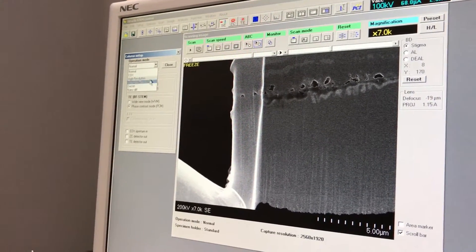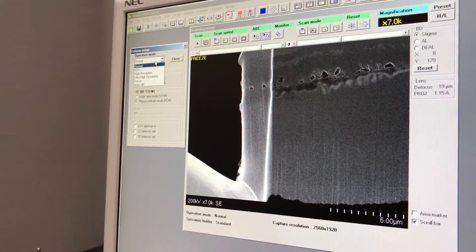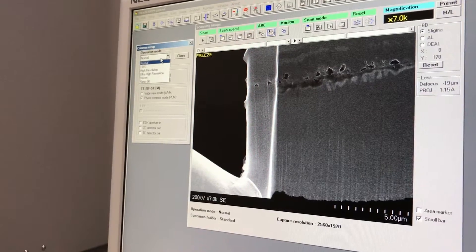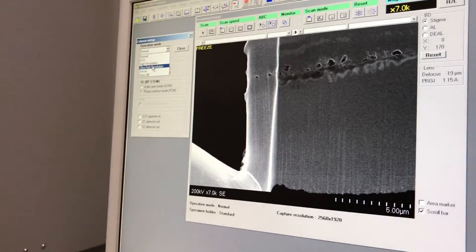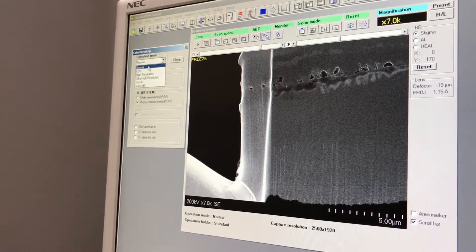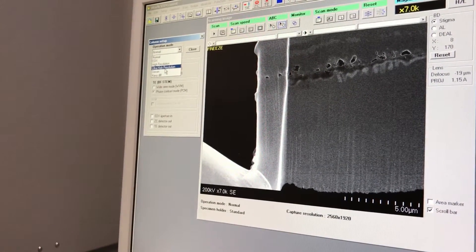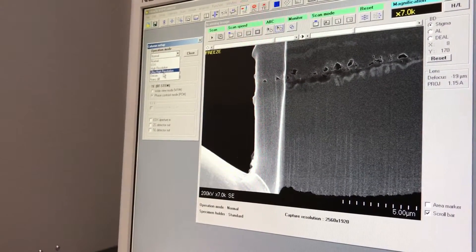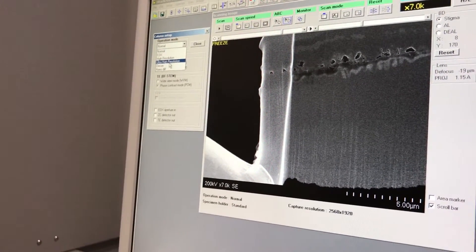The main modes you may use during your analysis are normal, high resolution, ultra high resolution, and nano diff. The difference between these is that with less resolution you have a bigger spot size and more signal, but your resolution is lower. Comparing normal and ultra high: on normal your spot size will be bigger but your resolution is less. Sometimes, if your sample is not thin enough, you need to increase your spot size, giving more energy to the beam, in order to get any image with the STEM.